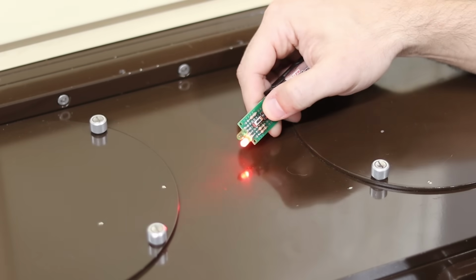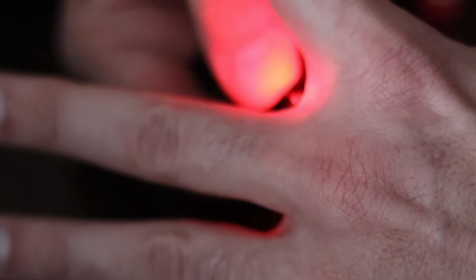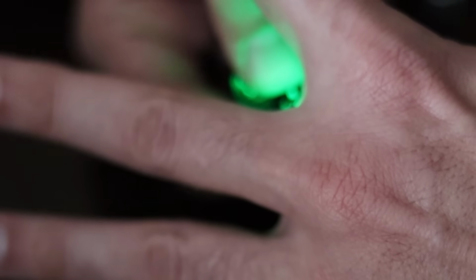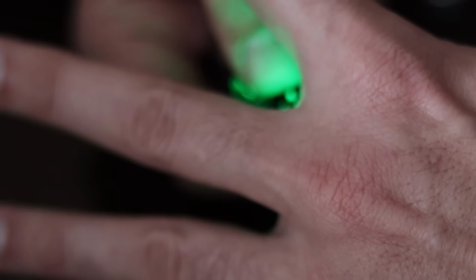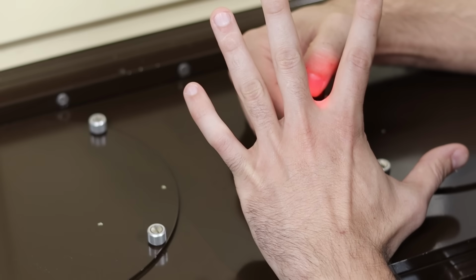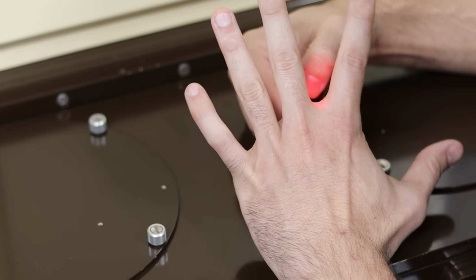So if I push the button here to get the red LED illuminated and I hold it up against my hand, I can see that red light is passing through. However, if I flip the switch, put it over to green, and I hold it up to my hand, I can't see anything coming through my hand that is green. So green is being fully absorbed or reflected by my hand, but if I switch over to red here, that is transmitting through my hand.